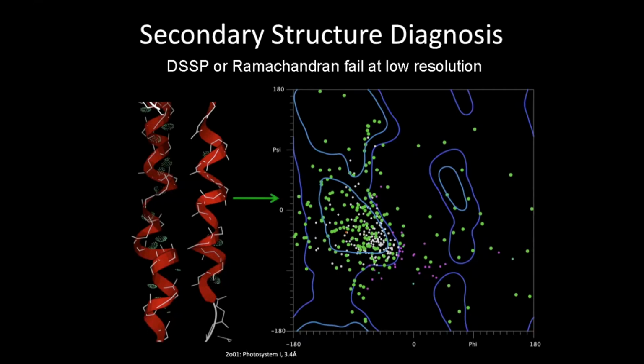Because what happens is that at 2 angstroms, for instance, the helix is a spiral and it's 0 density down the middle. And at 5 or 6 angstroms, it's a tube and the middle is the highest density. And at 3 angstroms or 3.5, it's going between those two regimes, and it doesn't do it consistently. And so if you follow all of the detail there in the map, you'll get some of it wrong.